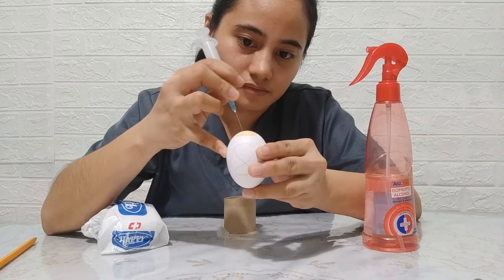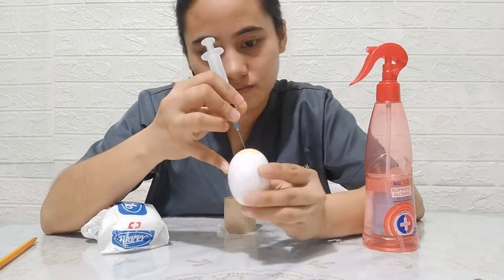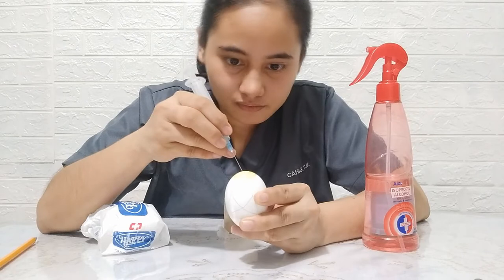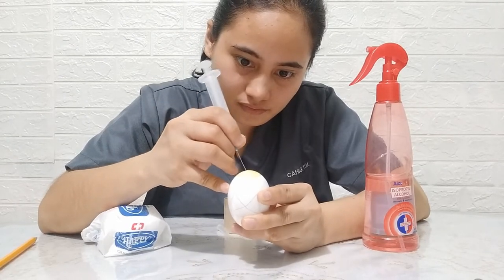Pierce a hole on the shell with a needle using a twist-and-turn technique. Supposedly, an egg borer is used in this step, but due to the distance learning setting, an improvised egg borer or syringe will suffice.